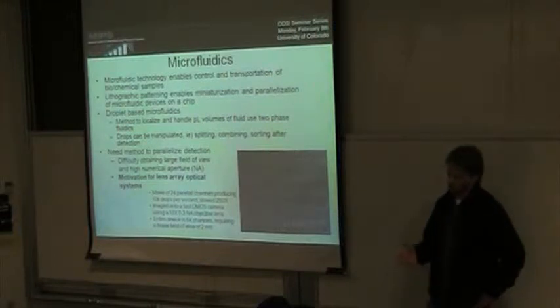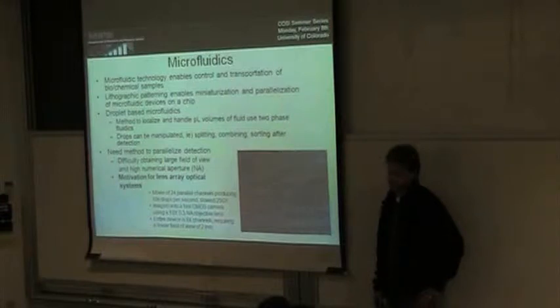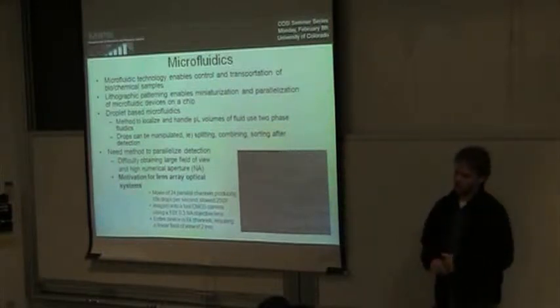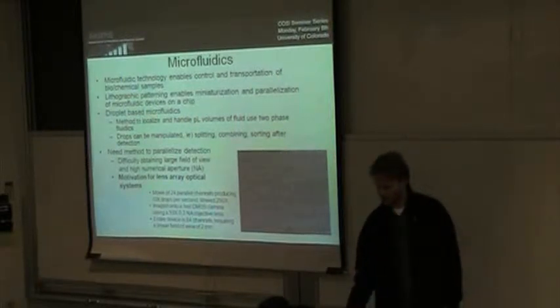And we're going to use an integrated lens array to read out the signal in this array of microfluidic containers. And this lens array can help us solve this problem of needing to detect efficiently over a large field of view in an integrated system that will hopefully be much simpler than those large flow cytometers and potentially much faster as well.